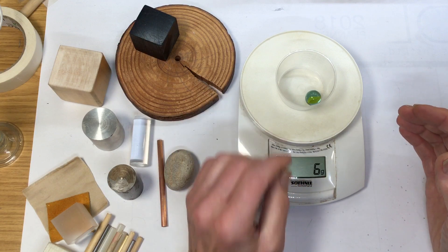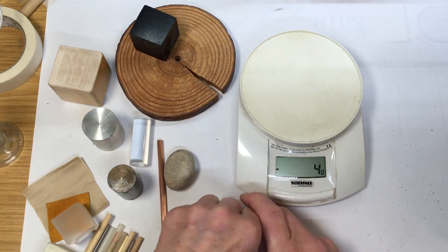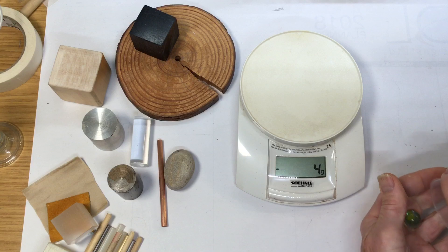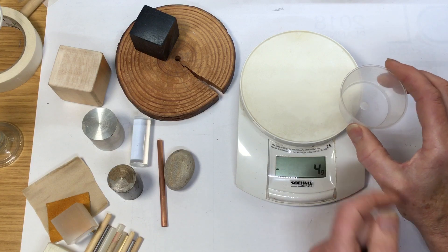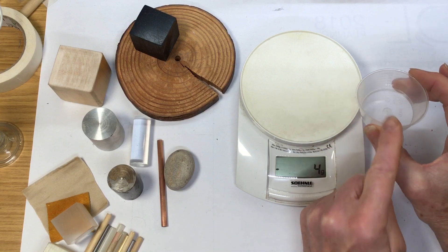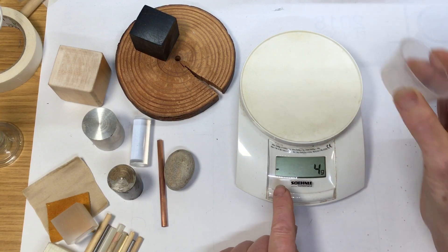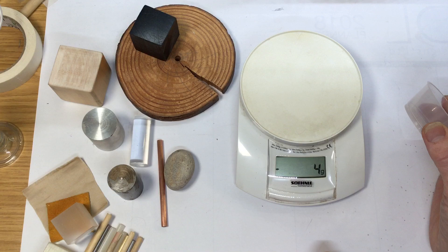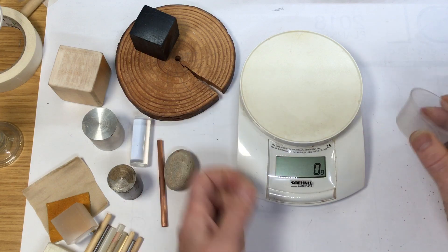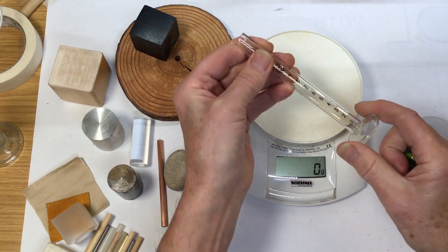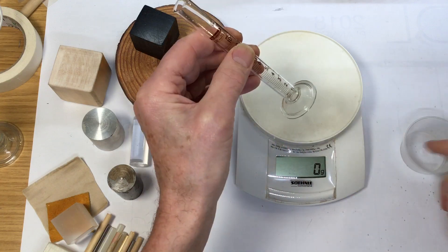Similarly with liquid - look at that, minus four grams, because we had previously used the tare function to zero the balance. Now we've taken it off, it's showing minus a mass of four grams. Let's just tare it again - back to zero.